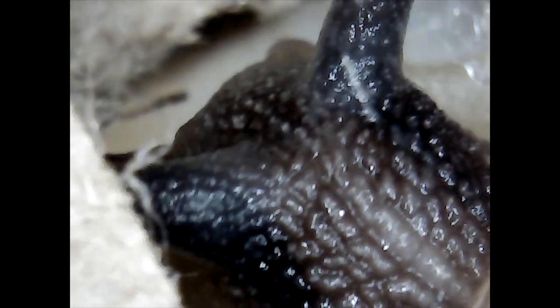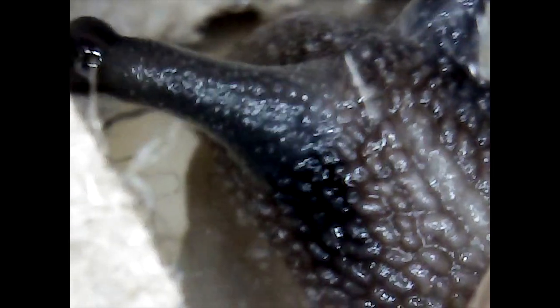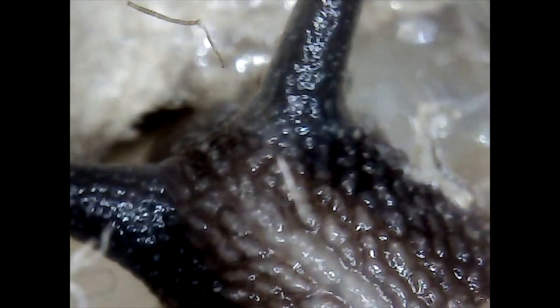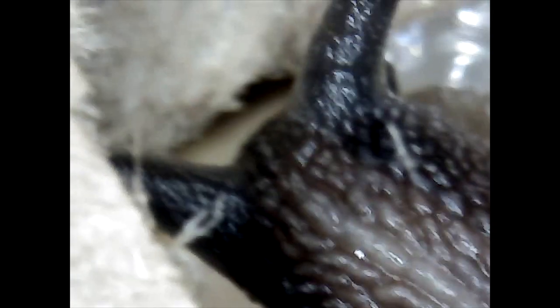A land snail is any of the numerous species of snail that live on land, as opposed to sea snails and freshwater snails. Land snail is the common name for terrestrial gastropod mollusks that have shells. Those without shells are known as slugs. However, it is not always easy to say which species are terrestrial, because some are more or less amphibious between land and freshwater, and others are relatively amphibious between land and saltwater.